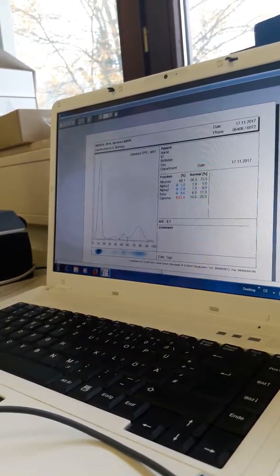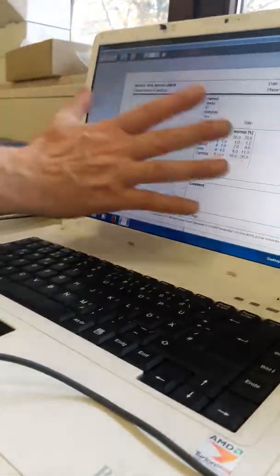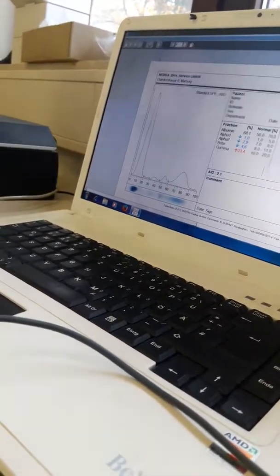Yeah, and then you just need to print it, but this is not working at the moment. I have no printer here. But this is the original preview of a print. Okay. This should come in the test.